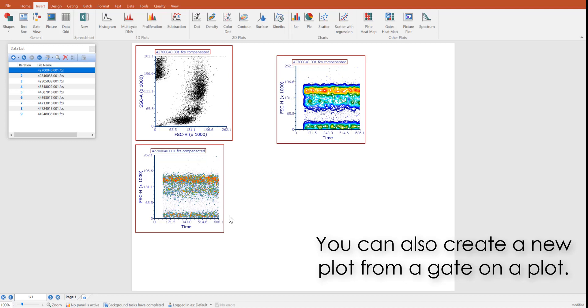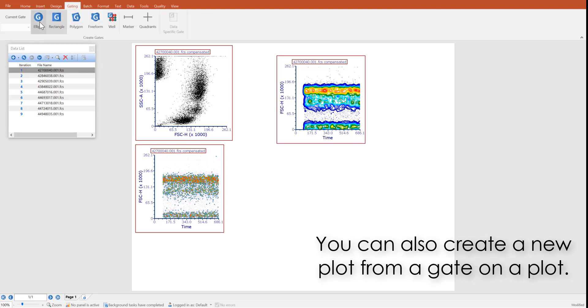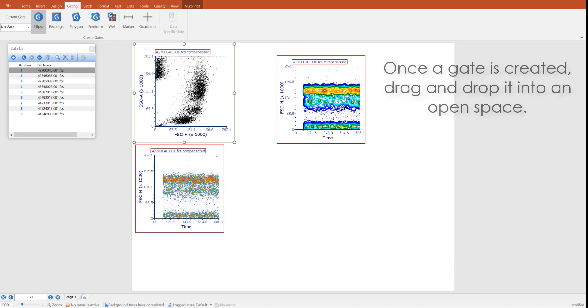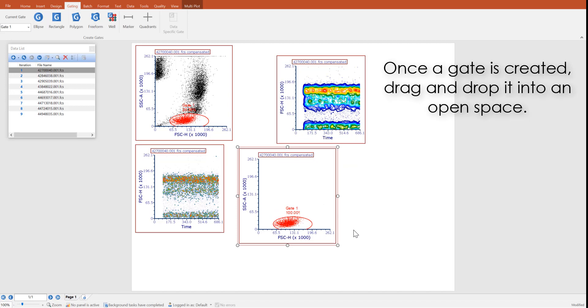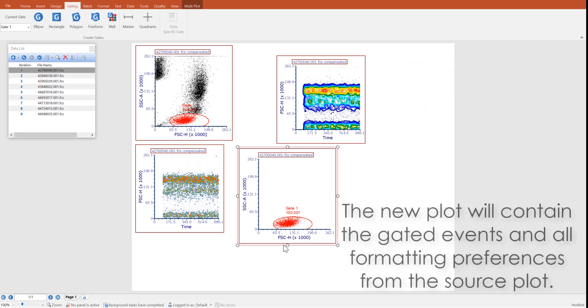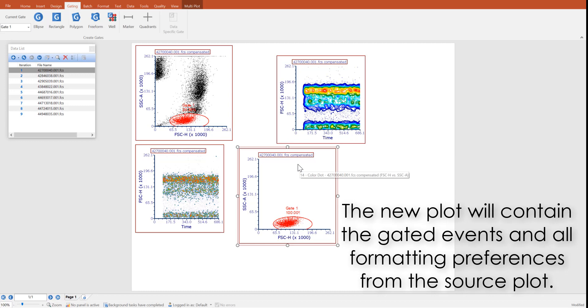One final way to insert a data plot into a layout is by creating a gate on a plot and dragging and dropping that gate into an open space in the layout. The new plot created contains the gated events and any formatting preferences from the source plot.